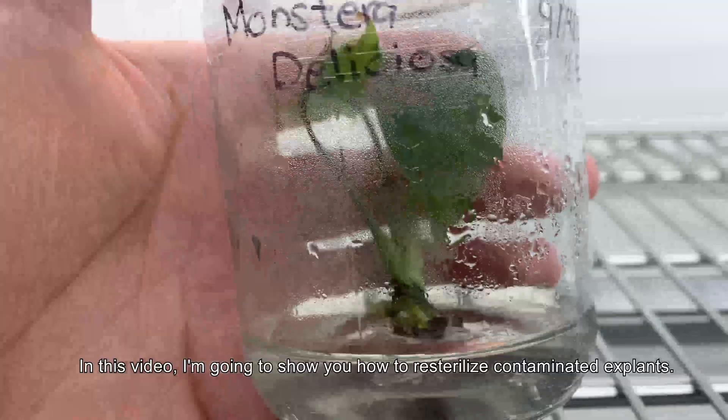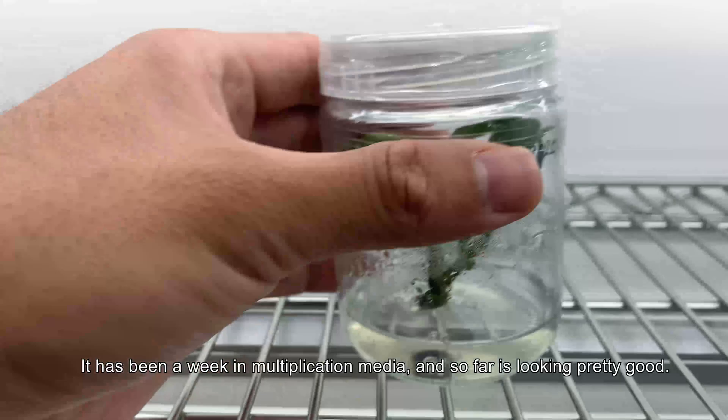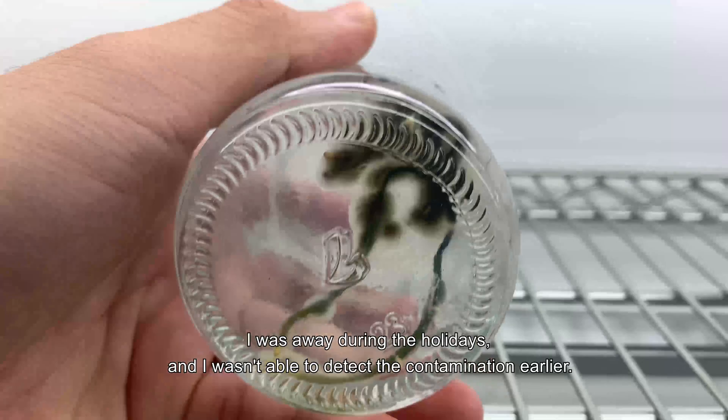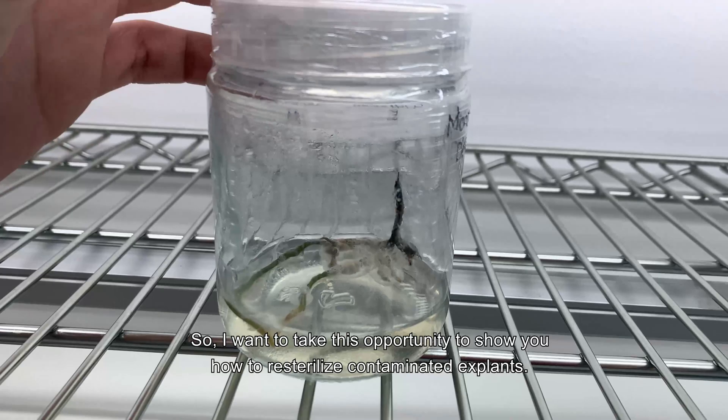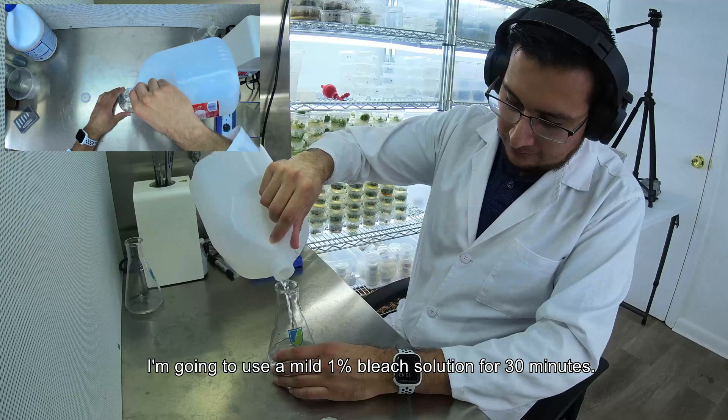In this video I'm going to show you how to re-sterilize contaminated explants. First I want to show you the progress on the Monstera Deliciosa — it has been a week in multiplication media and so far it's looking pretty good. Unfortunately the roots got contaminated with fungus. I was away during the holidays and wasn't able to detect the contamination early, so I want to take this opportunity to show you how to re-sterilize contaminated explants.